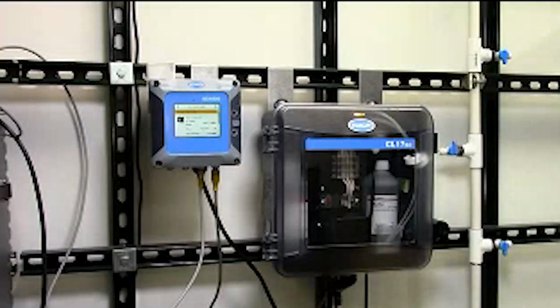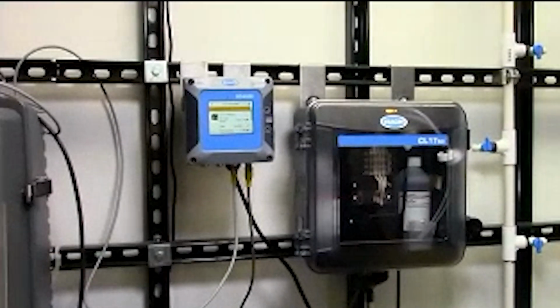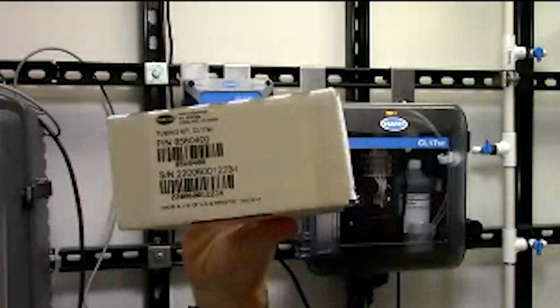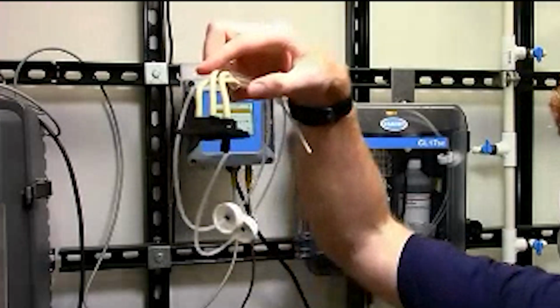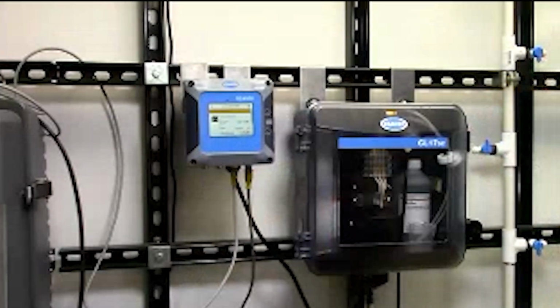So with that said, I'm now going to switch my camera over, and I want to really emphasize how quick some of this maintenance is done. This maintenance is done about twice a year, and what I want to show you is that to do this maintenance, I'm going to be using a kit that looks like this. It's going to have a part number and a serial number, and in my kits, what I have is a new tubing kit, and I have a stir bar. And again, you're going to be doing this about twice a year, every 6 months.